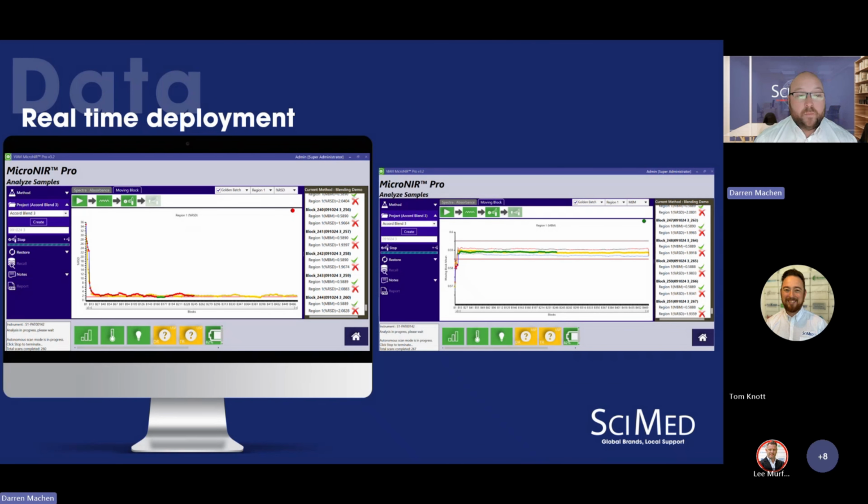And then once you've developed your method, just like on the handheld device, you can have real-time deployment as well. So you get real-time process analytics going back to the server to allow anybody to make decisions based on throughput, on what the NIR is seeing. A lot of the materials, well, most of the materials that are in food are a varying input. So by having PAT as a tool, you can cope with varying input to give a fixed output. And that is one of the main reasons why people use PAT technology.